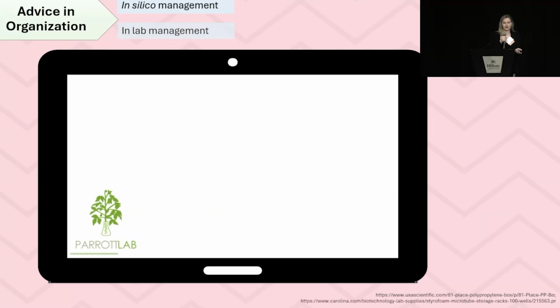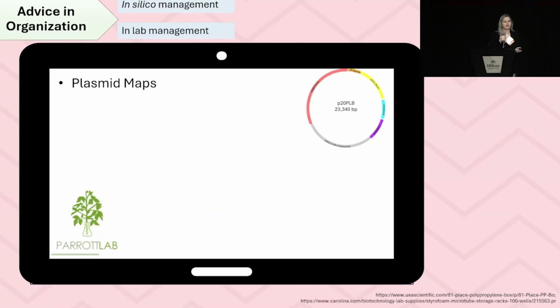So everything that I upload to the cloud includes plasmid maps, so they know, like if someone wants to use AmCyan as a selection, they would know that I've already made a plasmid for that and they don't have to remake that.